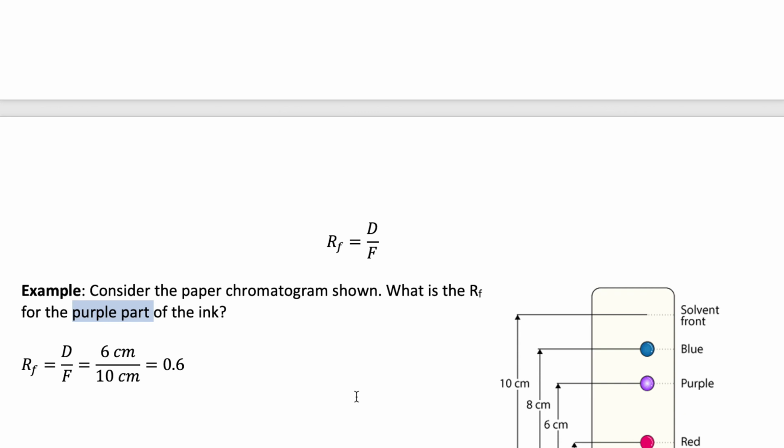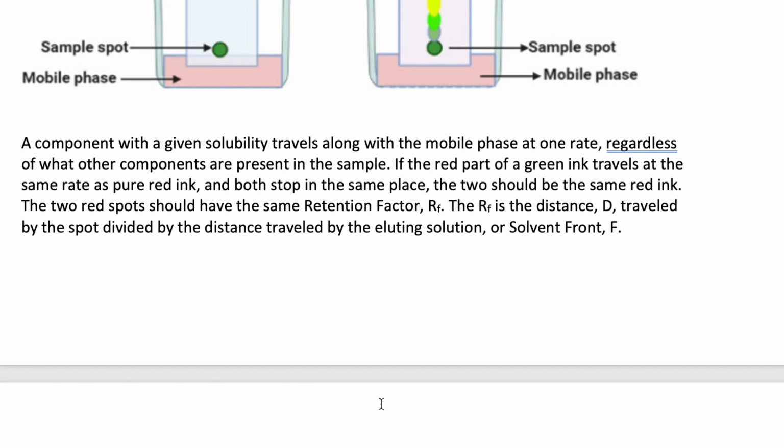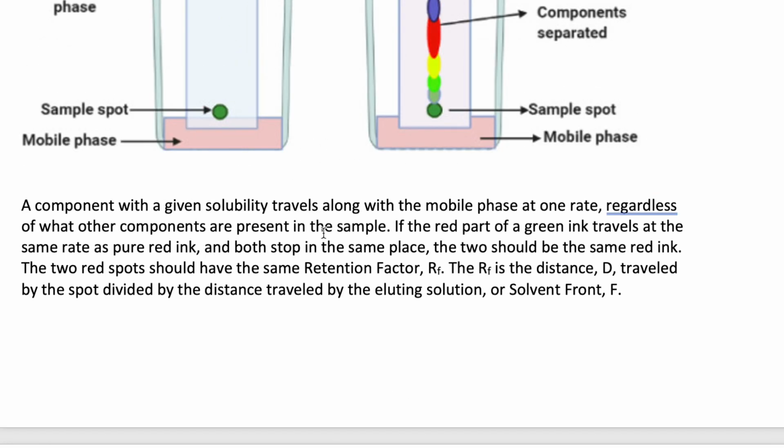In your lab report, you're going to have to calculate the RF. You're going to have to identify how many spots exist in the sample that we're going to be working on.